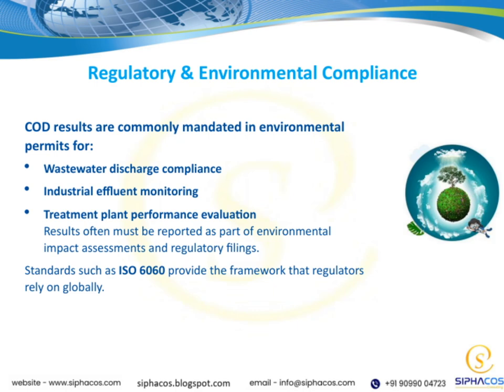It's also important to understand that these results are frequently included in environmental impact assessments and regulatory filings. This means they are part of the documentation that demonstrates compliance and environmental responsibility. On a broader scale, standards like ISO 6060 serve as the global framework that regulators rely on. These standards ensure consistency, reliability, and comparability of results across different regions and industries. Overall, adhering to these compliance requirements not only helps protect the environment, but also supports sustainable operations and regulatory trust.